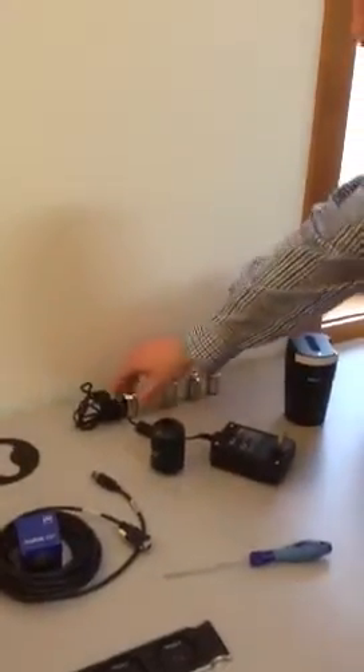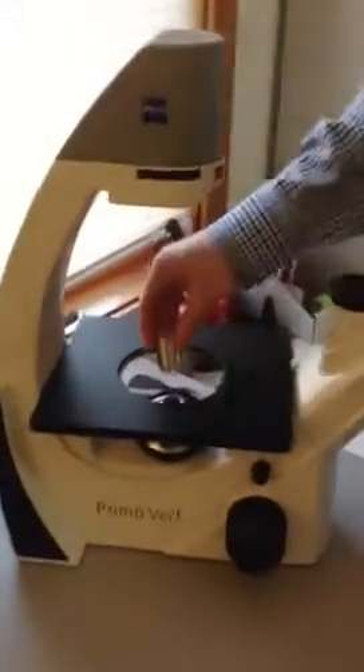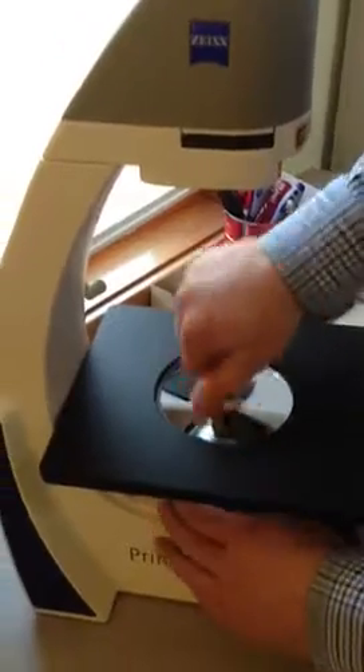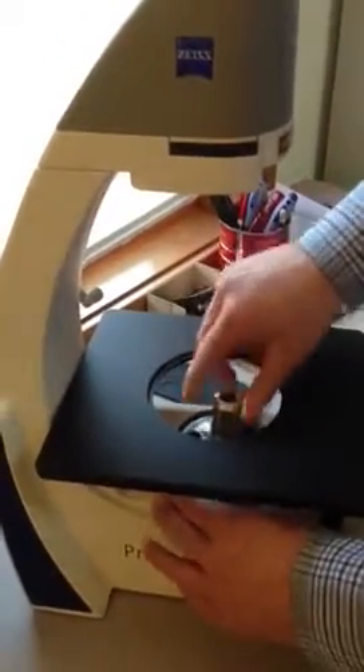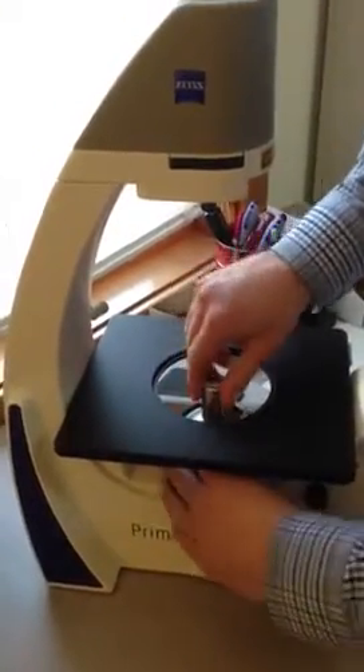Next you can install your objectives. You're just going to install them in successive order. Grab the 4X objective and go right through the hole in the stage — no alignment needed, they just screw right into the nose piece. Get them just hand tight, no tighter than that. Just one after another, screw the objectives in.